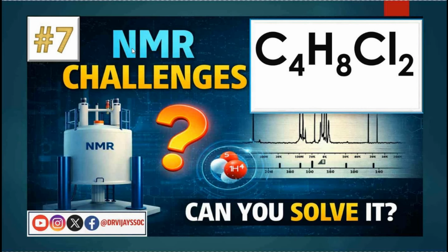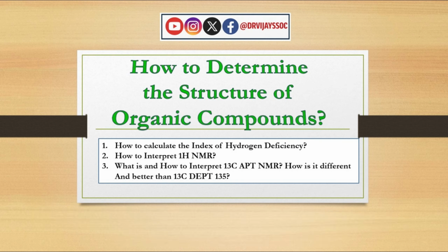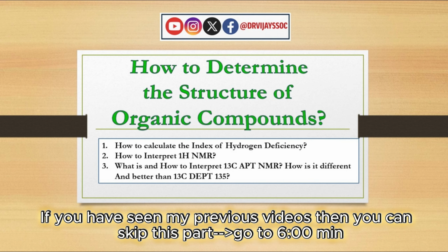This is our seventh NMR challenge, in which we are going to determine the structure of the compound having molecular formula C4H8Cl2 from the given 1H NMR and 13C APT NMR. While determining the structure of this organic compound, we are going to follow all those steps which we learned in the last videos. First we will calculate the index of hydrogen deficiency, then we will look at 1H NMR, and after that we will look at 13C APT NMR.